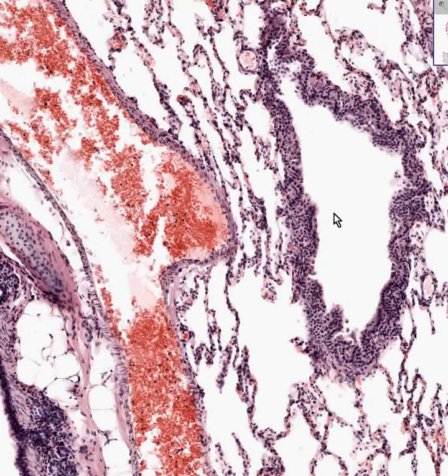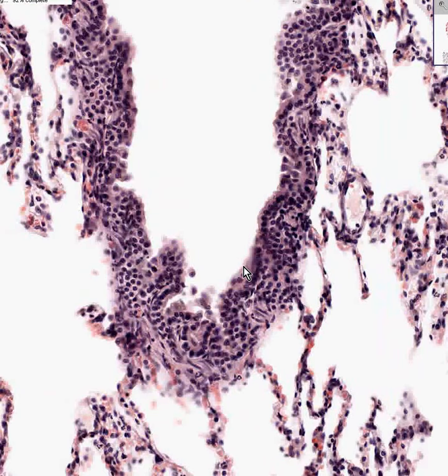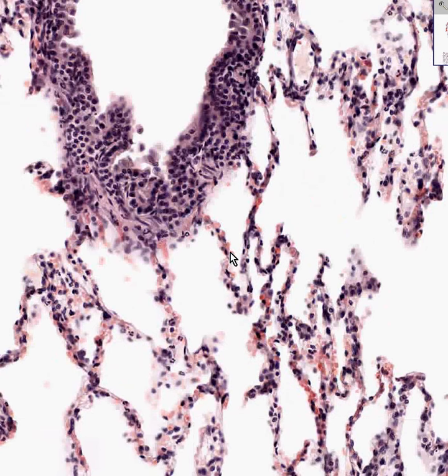Here is a bronchiole in which, because you do not see cartilage, and it is also lined by an epithelium which, like in the bronchus, is columnar, pseudostratified, and ciliated. Here are actual alveoli, and here is the wall of an alveolus, and you can see all of these little red things stippled in the alveolar wall are actually capillaries.